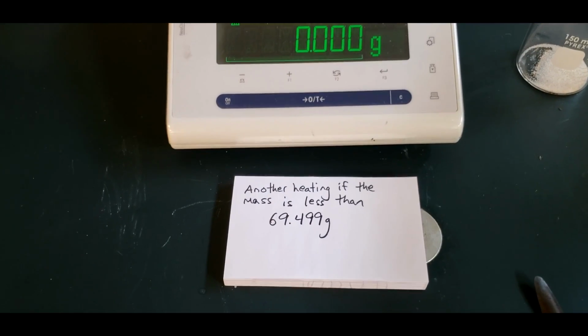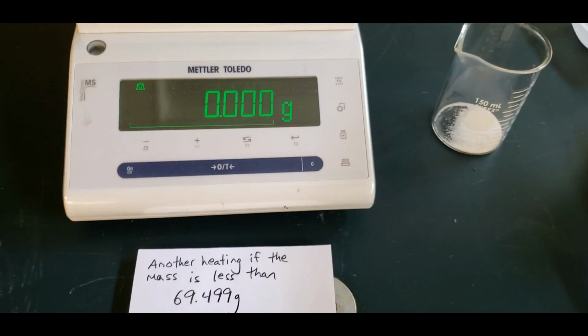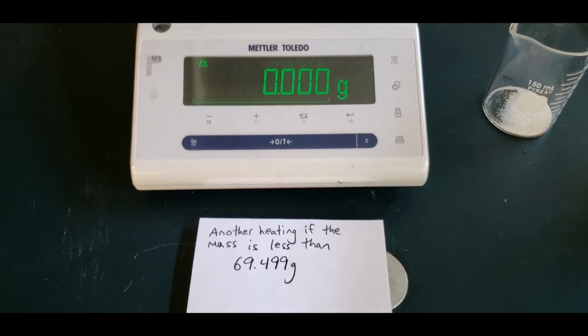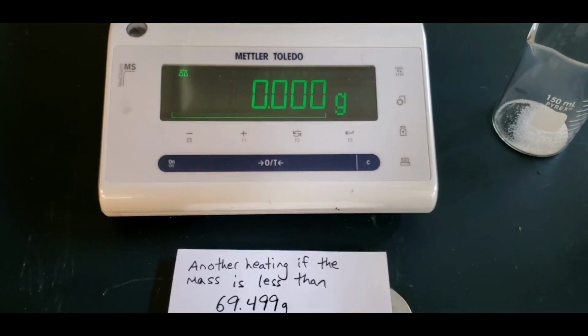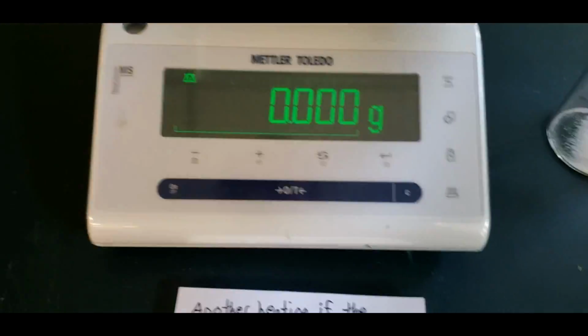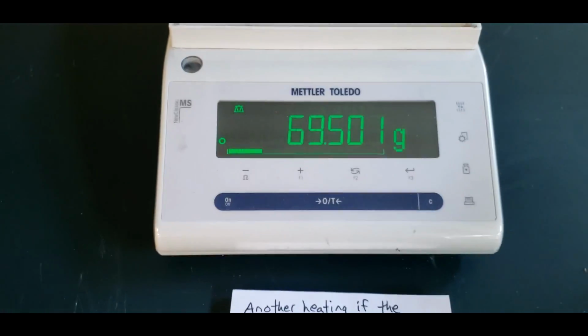So the test from the lab book says that when we weigh out our sample, if it's under 69.499 grams, then we have to do a third heating, because we're going to assume that we had a lot of ammonium chloride left, and maybe there's still some in there. So let's do this. See what we get.